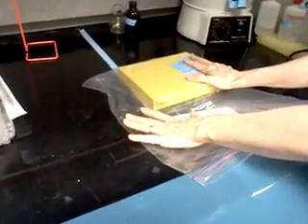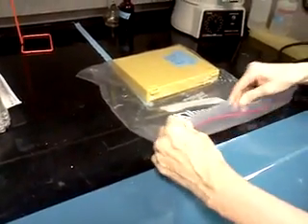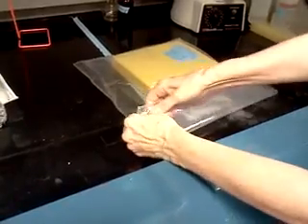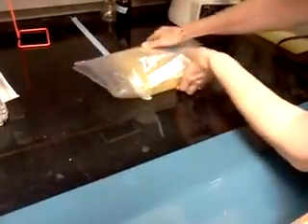Now, when you put them in here, these things, you don't want them to dehydrate. So that's why I have them in a really heavy plastic Ziploc bag. There's no oxygen in there. And then that keeps them from drying out. You don't want your teeth to dry out.